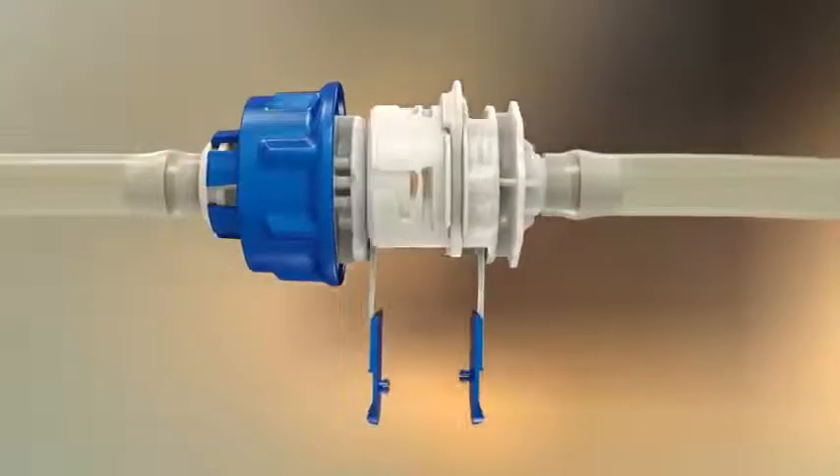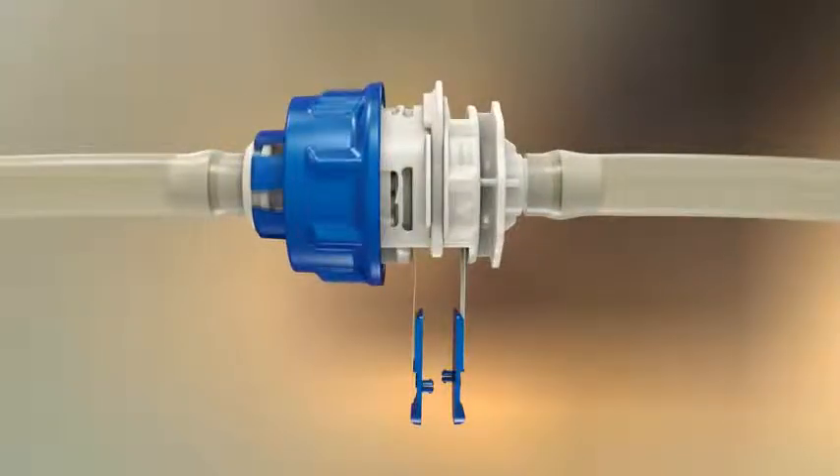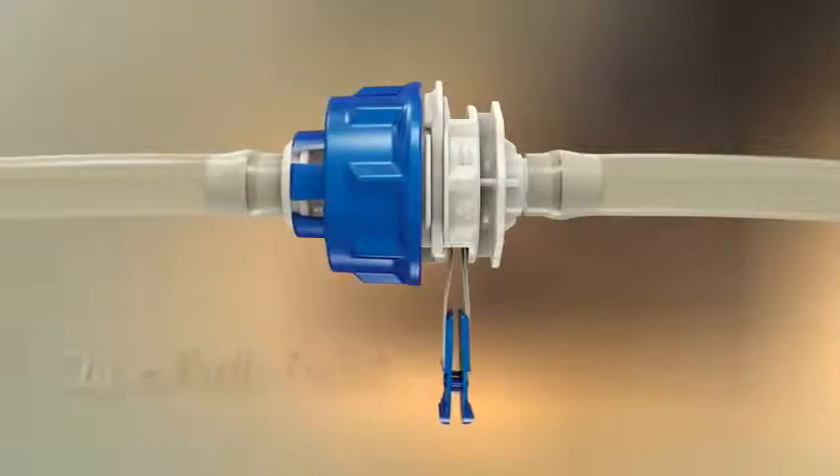Align the male and female couplings. A slight rotation of the lock ring may be required. Push the connectors together. Engagement is confirmed by the Kolder Click.